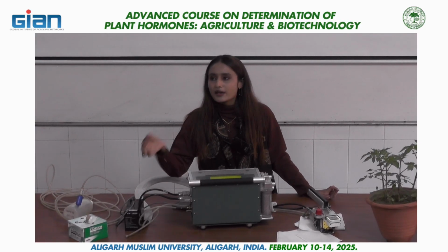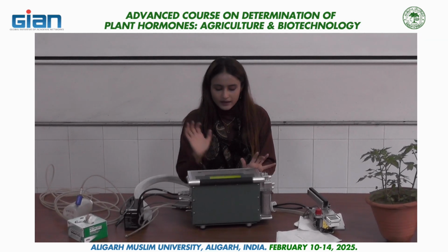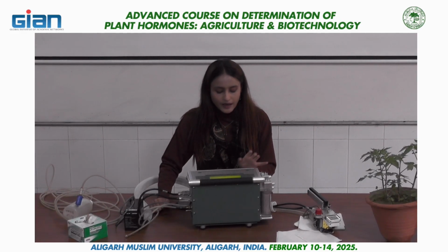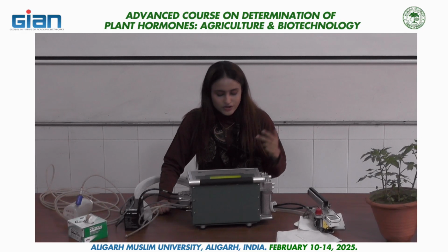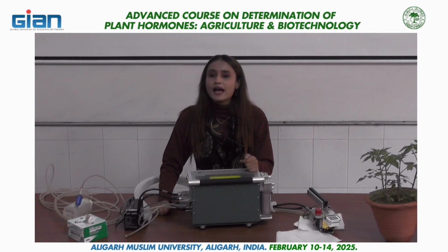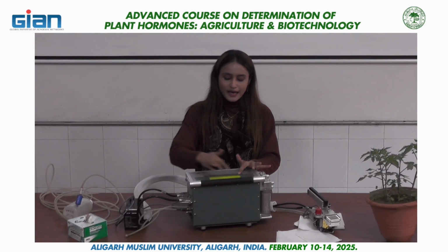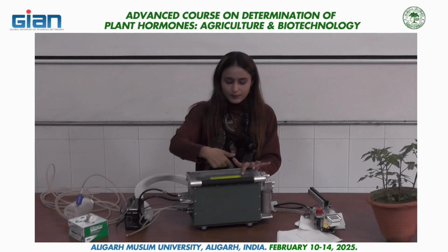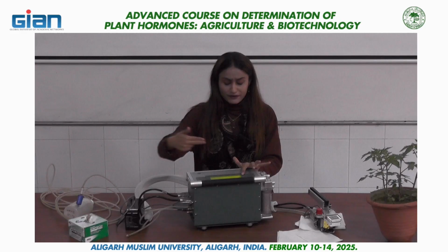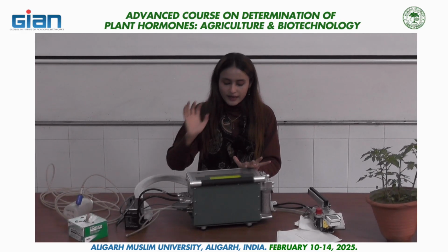So there is Y or N. Y stands for yes, N for no. Just you have to select here Y. Again processing is going on. Now the options coming here are welcome menu, configuration, calibration menu, new measurement, and utility menu. Obviously we have to take new measurement. New measurement is at the F4 option. For example, welcome menu at F1, configuration at F2, calibration at F3, and new measurement at F4. So we have to select the F4 button here.